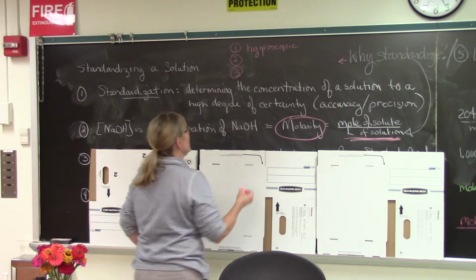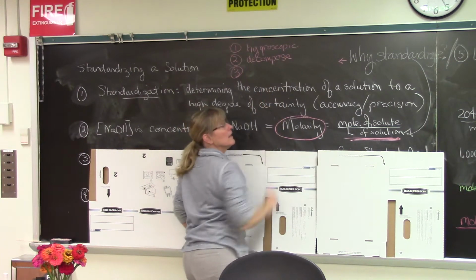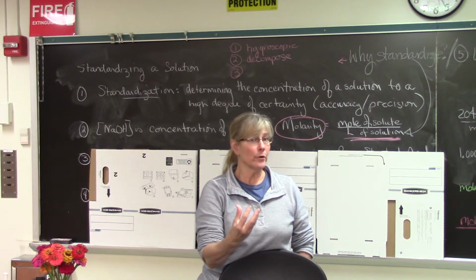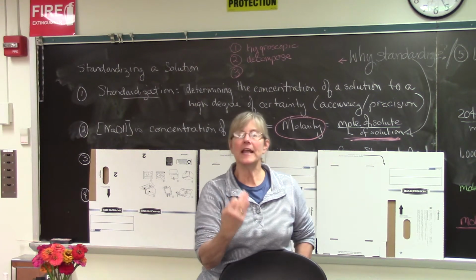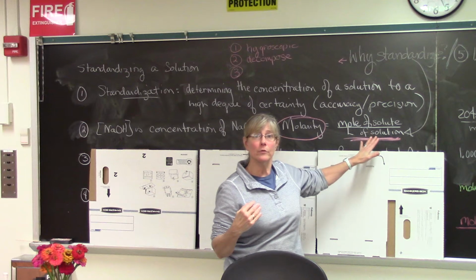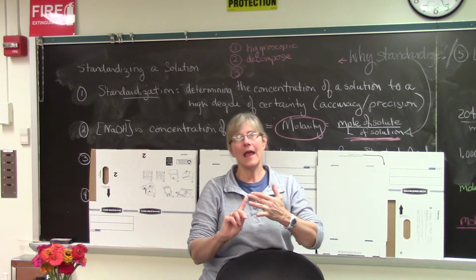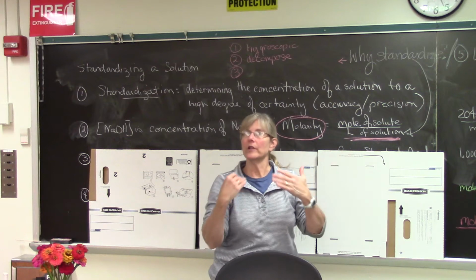A second problem can be that a substance can decompose. Substances can decompose when they're just sitting around as solids or liquids or even gases. They can decompose very quickly. So what we need to do is get it into solution as fast as possible. But again, that mass that you've got to find the moles of your solute can be, by the time you actually get it into solution, partly your substance, your solute that you want, and partly those decomposition products. So again, I'm not going to know accurately the moles of my solute.